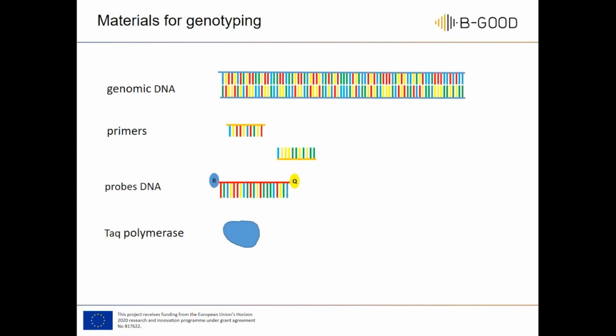Like any PCR, TaqMan assay reactions require a double-stranded template, as well as 2 standard target-specific primers. While 2 primers are all you need for regular PCR, real-time PCR with TaqMan chemistry requires 1 or more sequence-specific oligos, called probes. And of course, we need a Taq polymerase.